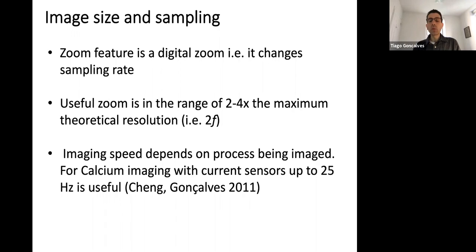And then what we did is we had the information about the firing from the patch clamp, and we had our calcium traces, and we tried to deconvolve them. So we tried to get back to the patch clamp, to the electrophysiology data, from the calcium data. And then you start averaging your data to simulate what it would be like to go slower and slower, meaning at what point do you go too slow to actually be able to reproduce the firing of the cell?